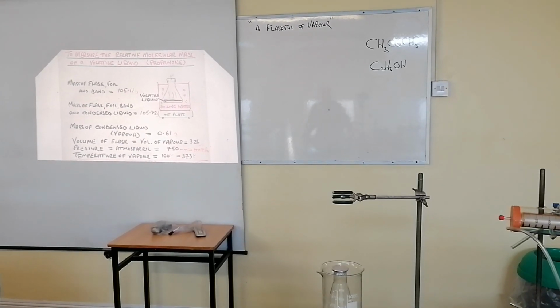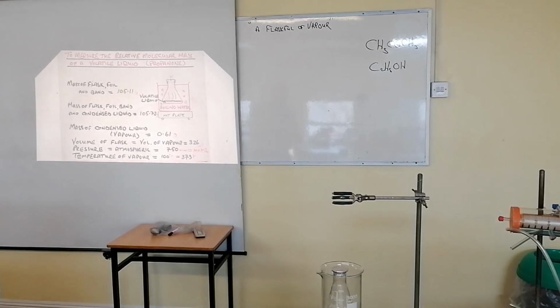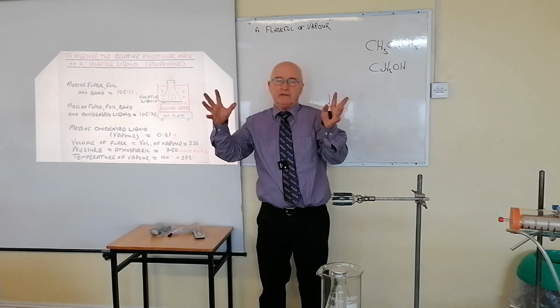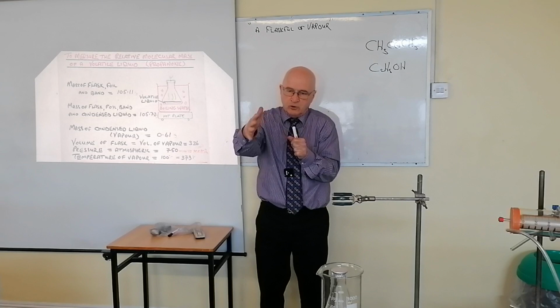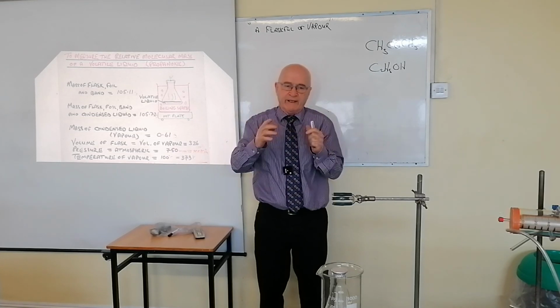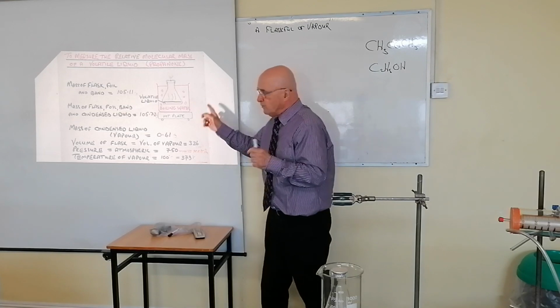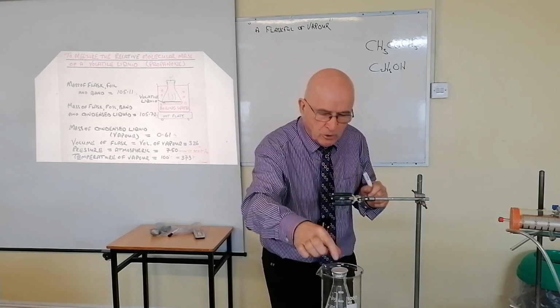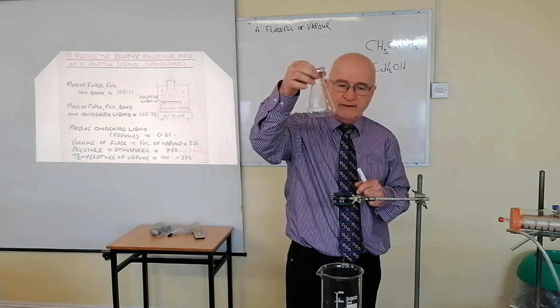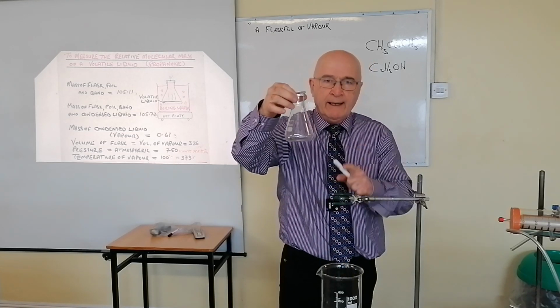Now, let me remind you, as we're going through this, that when you're looking at that now, you must be focused, and it will gradually disappear over a period of 4 or 5 minutes. It's going, it's going, it's going. It's gone, okay? And you'll make a decision. The moment that all the liquid is gone, you must take it out of the water bath. Now, can I remind you of something about this? I have a retort stand and a clamp here.